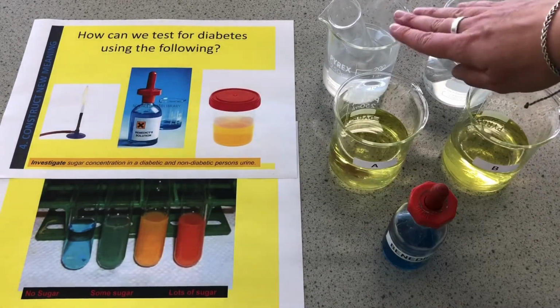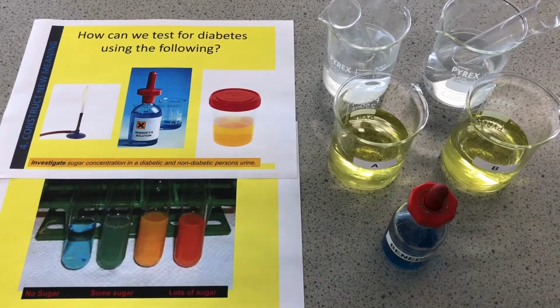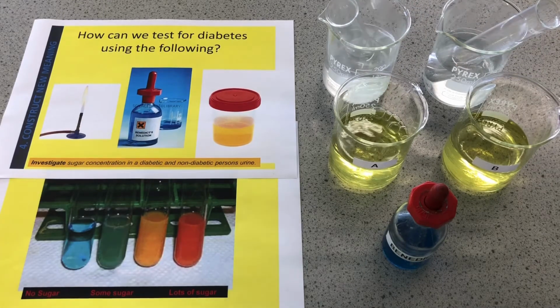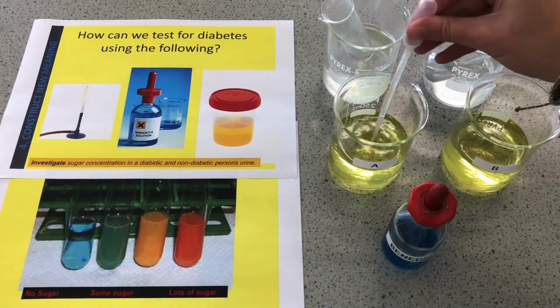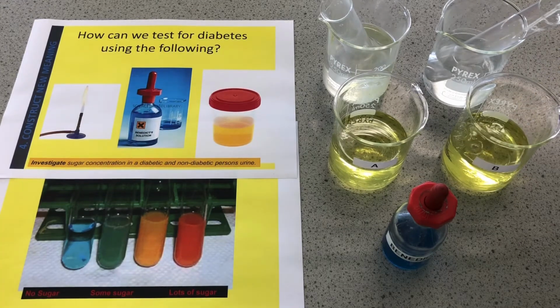I've got some kettle water in both of these beakers, using them as water baths, and I've got 2 boiling tubes ready to transfer some of my urine samples into those. So some of urine sample A is going into this boiling tube. Get quite a lot in there so we really see any colour changes. And urine sample B is going into this tube.